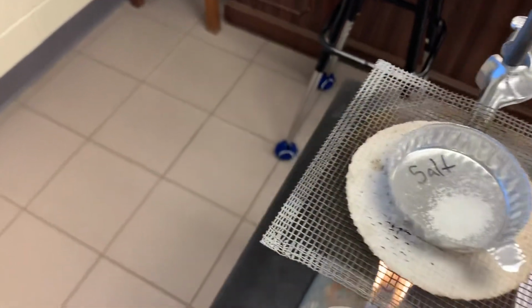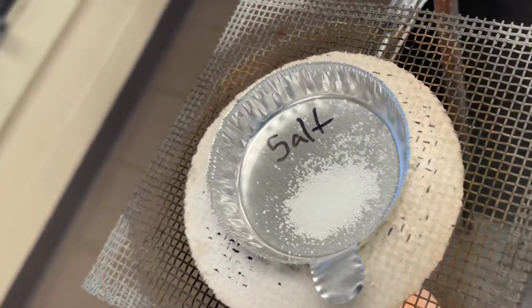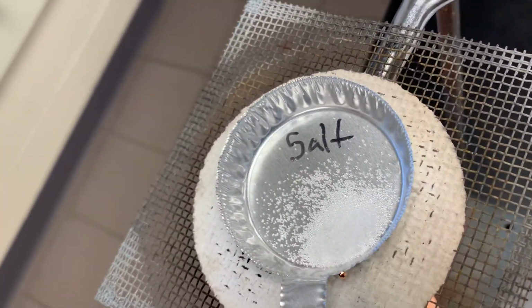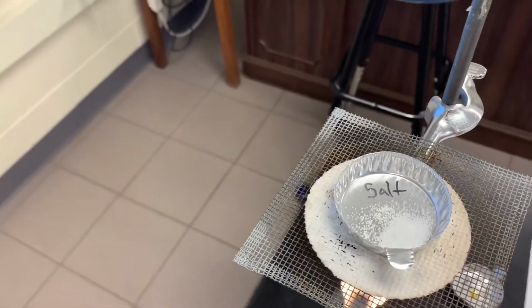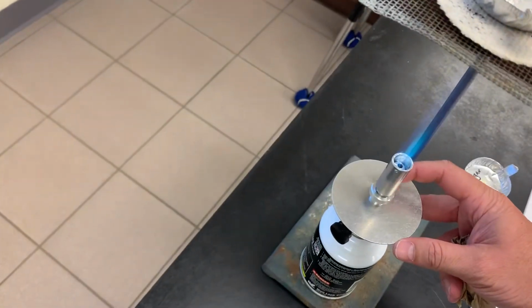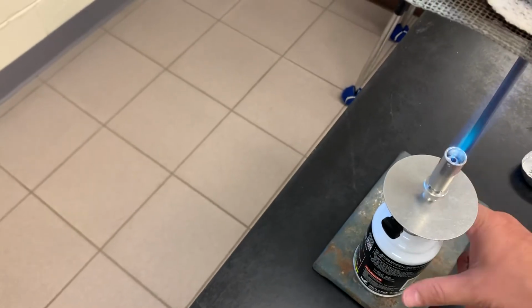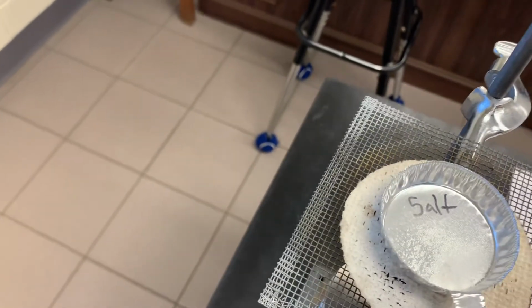I think we've done this long enough to see, okay, there is just nothing happening. Try to get good light here. The salt's just, you see it's not beginning to melt as I bump it around at all. It's just chilling. So as you can see, this is just not hot enough to melt the salt. If I do this, see if I can have some fun here. Give my bad boy a little more oxygen and get a little bit more heat on there. This turns the temperature up quite a bit, and hold it a little closer.